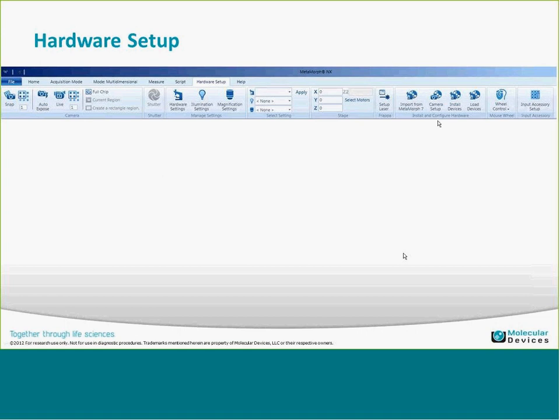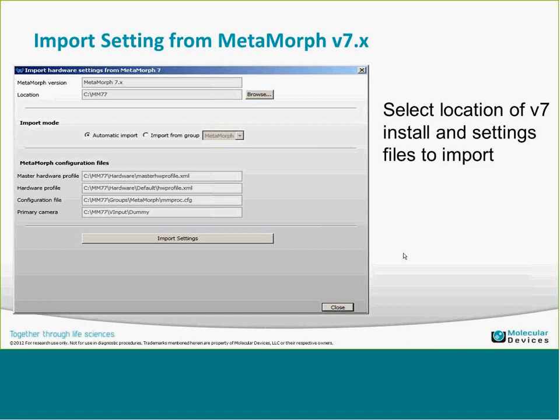The import from Metamorph 7 option — if you have Metamorph 7 installed on the system, you can import those settings directly. This can be somewhat finicky. I've had the most success selecting 'Import from Group' and selecting the Metamorph for Olympus group, using the default directories for those configuration files. That will import the hardware configuration, illumination settings, and specific camera information. If you've already had Metamorph for Olympus installed, you can bring those settings in to help with configuration.